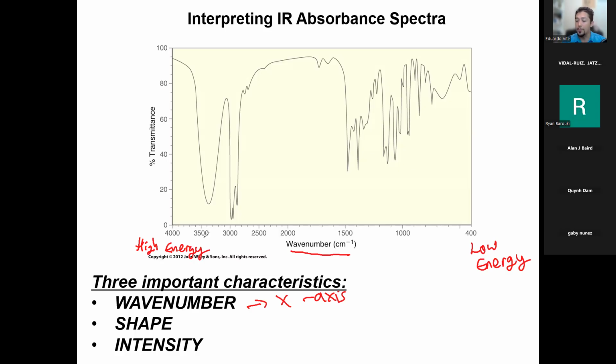So when you tell me about these peaks, you need to give me numbers. You can't just say that one in the center. Which one? Give me the number. You actually have a scale. Don't be exact. Don't be like, 1,737.5. You cannot possibly know that, right? Significant figures. Make your best guess, and it will generally be considered acceptable.